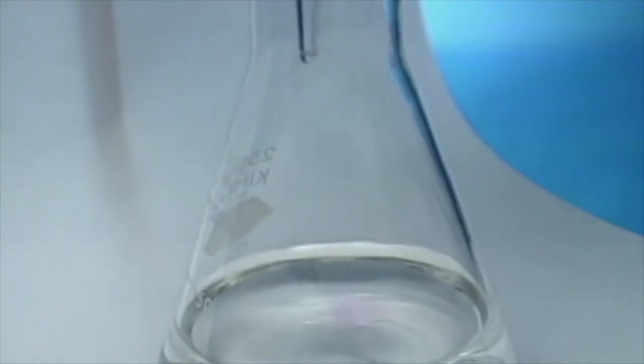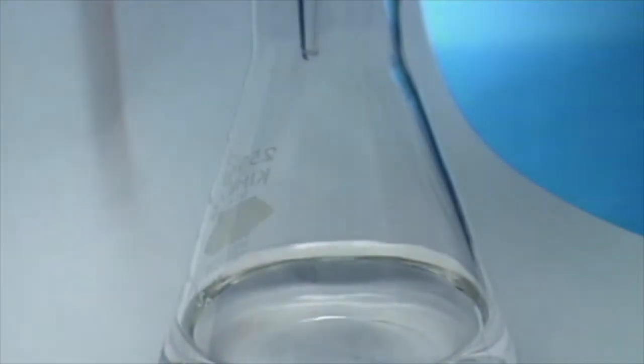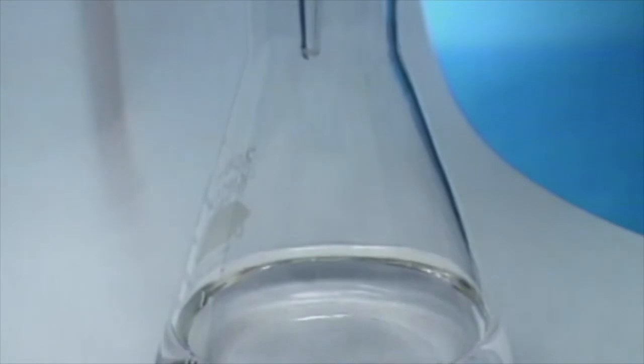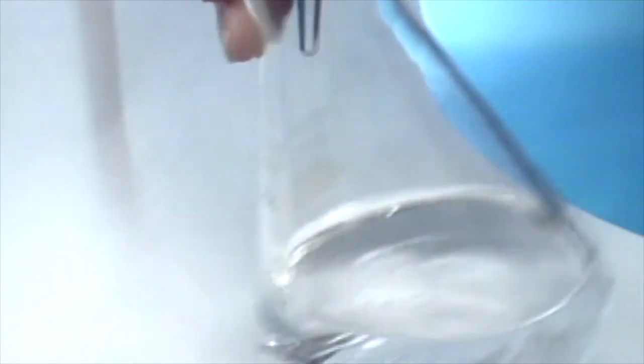Another technique for approaching the endpoint is to deliver titrant drop by drop, but be sure to slow down as the color starts to linger in the flask, or you may overshoot. Also, be sure to touch off any drops which hang from the burette tip. By delivering a single drop, or even a half drop, it is possible to catch the endpoint most effectively.